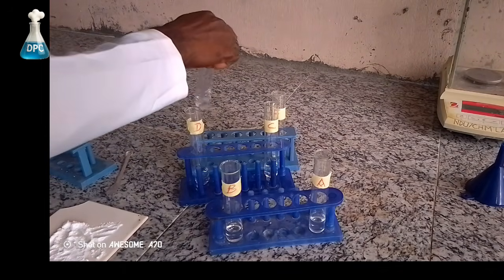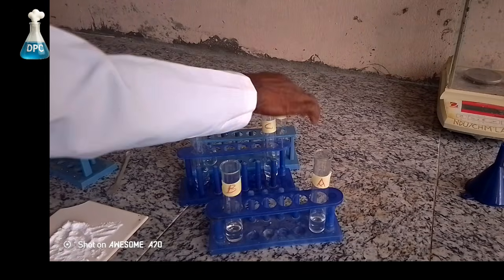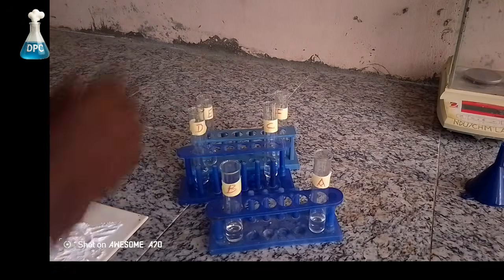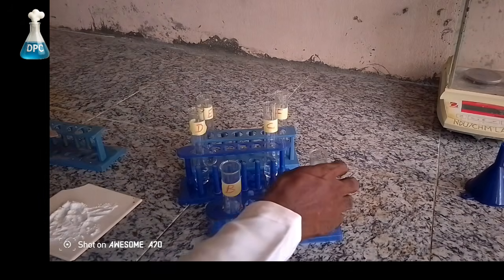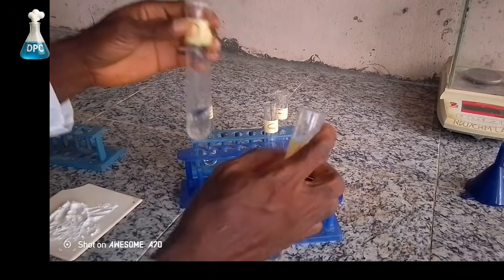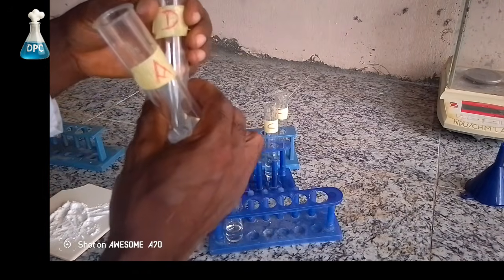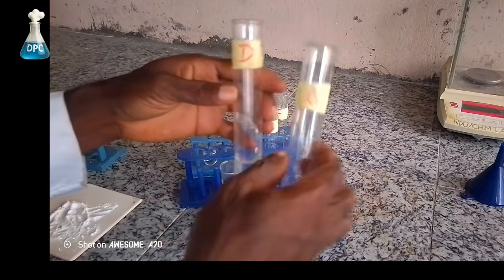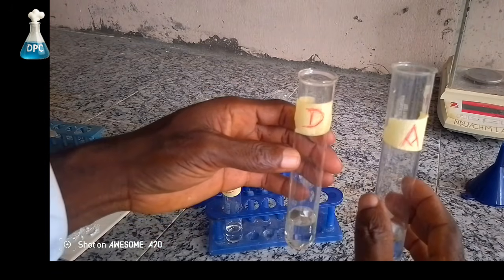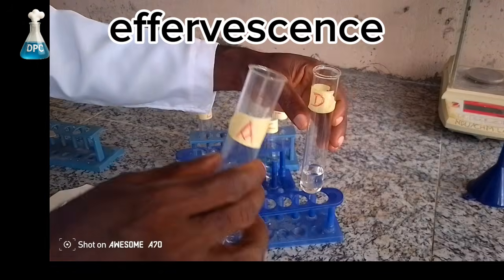After adding the water to the acid, you may need to agitate properly for proper mixing. After that is done, we are ready for our reaction. We can now pour solution A into solution D and observe the reaction. You must keenly look to observe the rate of bubbling, which is effervescence.